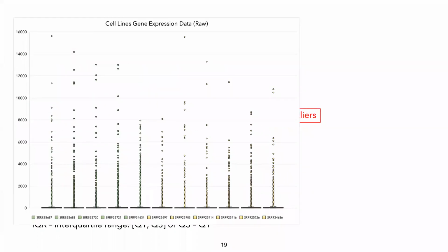Now, when we talk about gene expression data and we take the raw values, if you make a box plot of those values, they will look weird. They will look strange, because the bulk of your data is going to be here at the bottom and practically indistinguishable in terms of what's inside. So the bulk of your data is difficult to study.